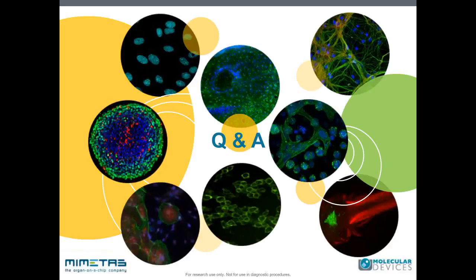Okay, and Dr. Joore, when I talked a little bit about how long it takes us to read 3D objects, someone wants to know how quick it is to image the organoids in the OrganoPlate and how many organoids per lane are we talking about?